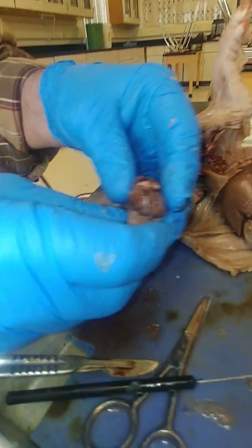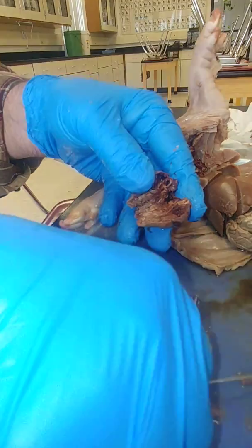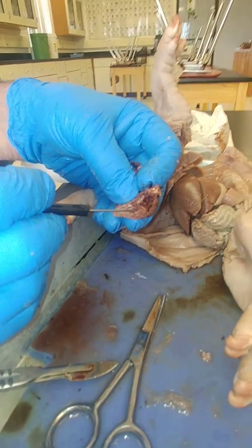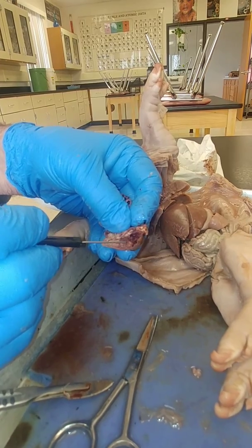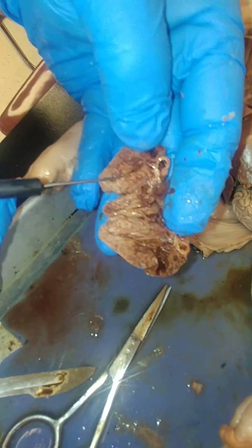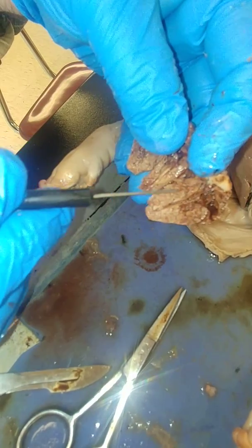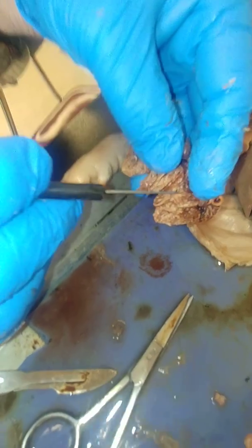Okay, so the heart was like this, got down through the atria, and you can see the space in here, and not real clear because this is fairly small, but this area down in here would be the left ventricle. Now when you look at the heart, this side is really thick. This is the septum, the center of the heart, and then this side here is fairly thin.